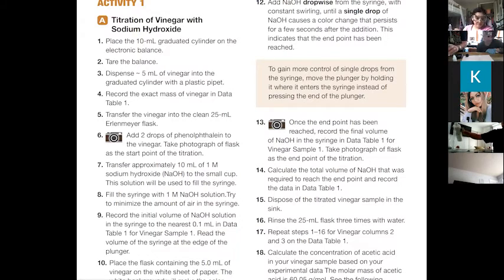And then we just squirt it out. Okay. There's a little one. So we just get it down till it's right at 10. See how it's right at 10 there? All right, we're ready to go. Let me just wipe that off. Just a little bit on me.